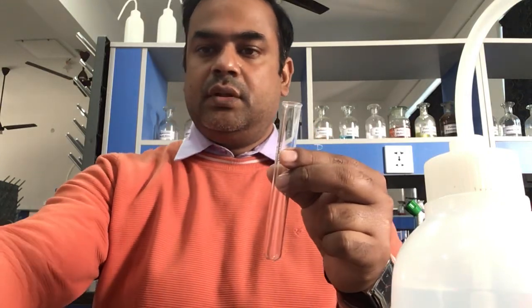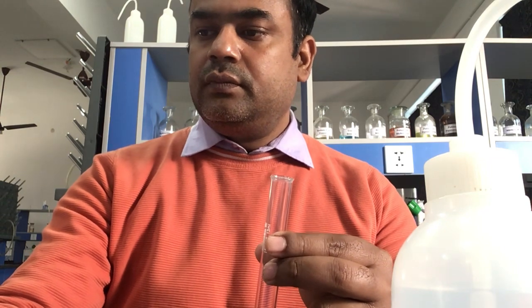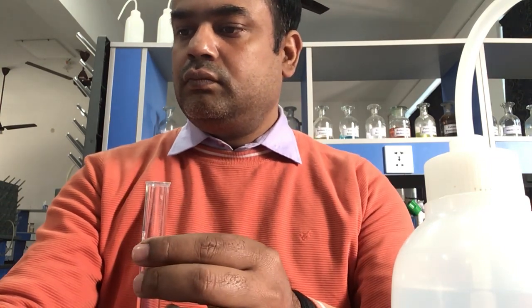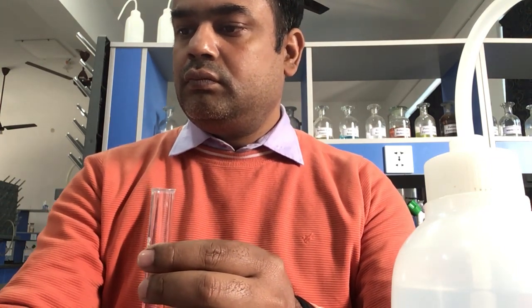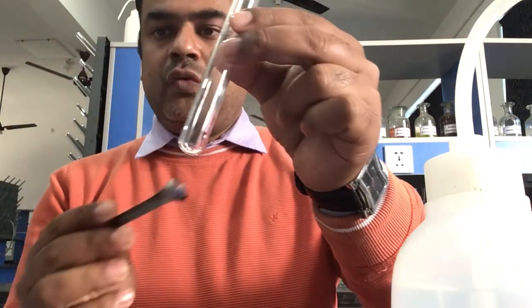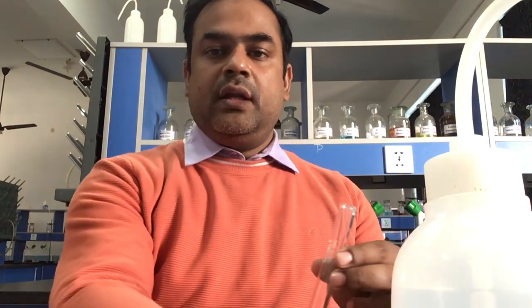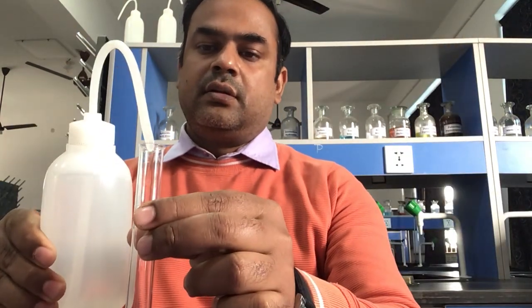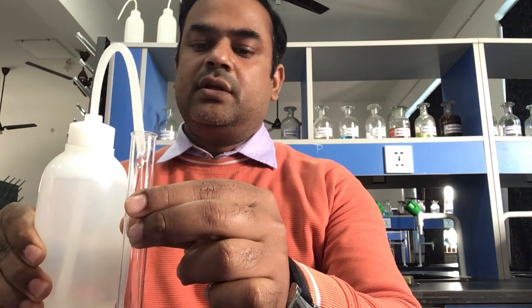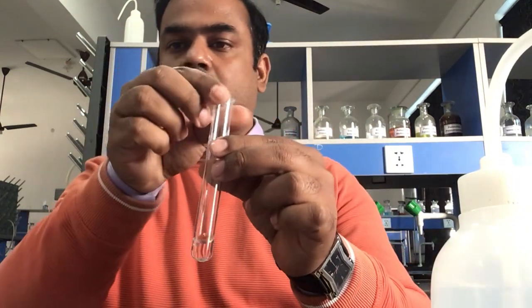A test tube is taken and a pinch of salt is added inside. You can see the salt at the bottom. Then distilled water is added into it to dissolve the salt.